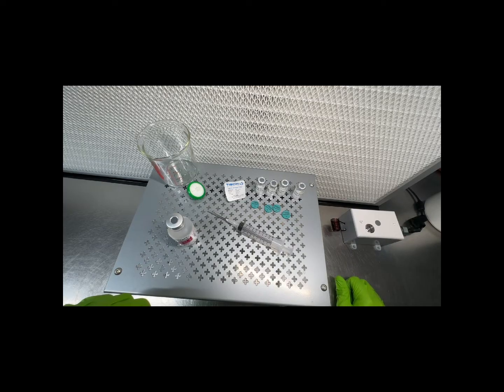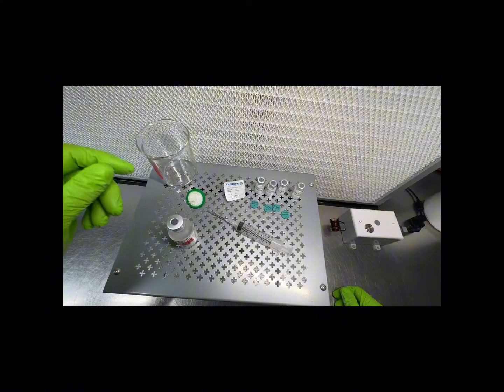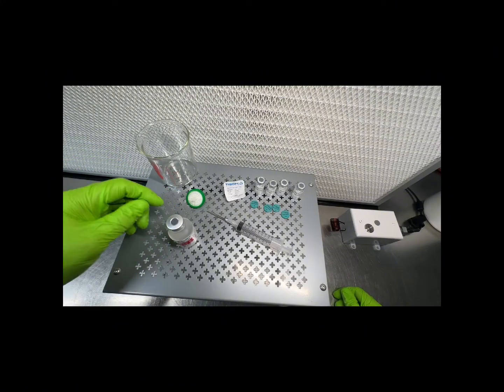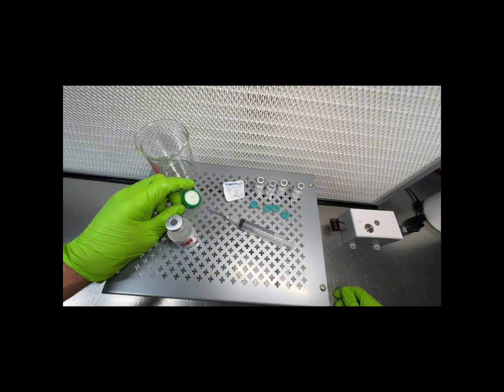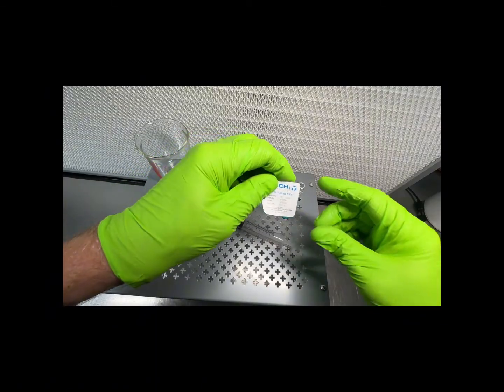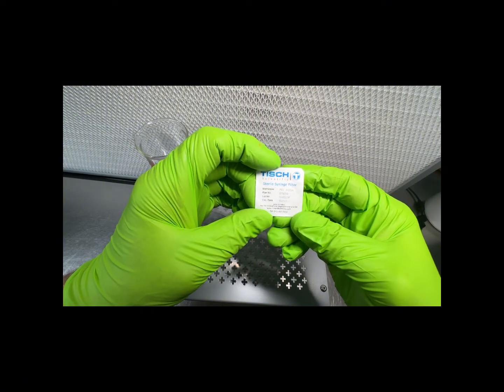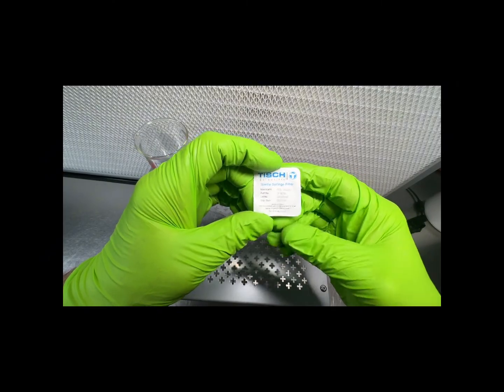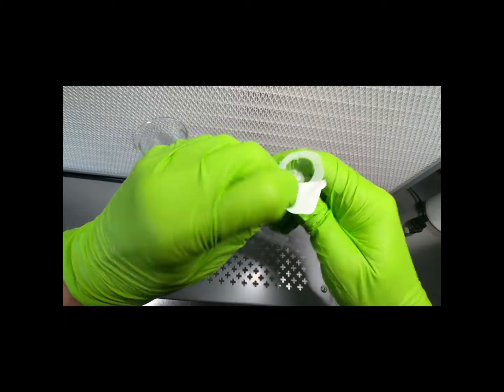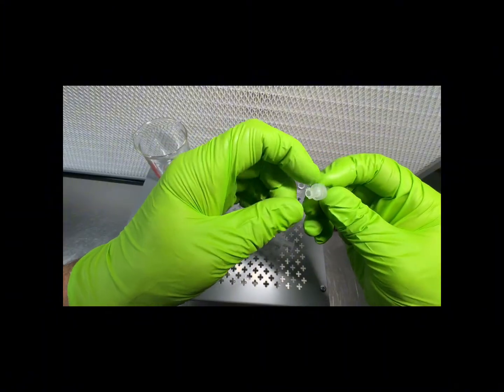Hi everyone, this is another video in our series of syringe filter videos. We have noticed there are a lot of different membrane types and sizes of syringe filters. We have been recommending this one for most peptide reconstitution, which is a PES membrane. It's 0.22 microns. That's the pore size, and then the diameter is 4 millimeters on the membrane itself, which comes in this round housing here.